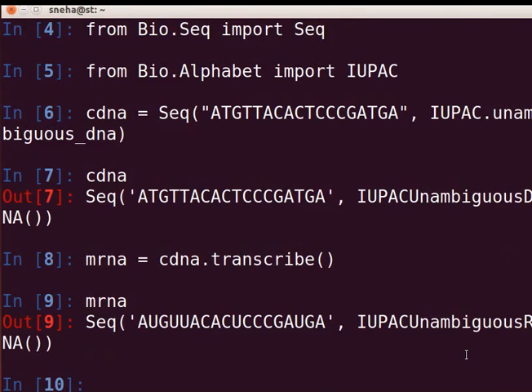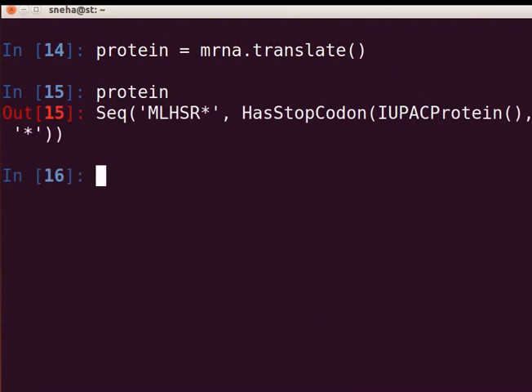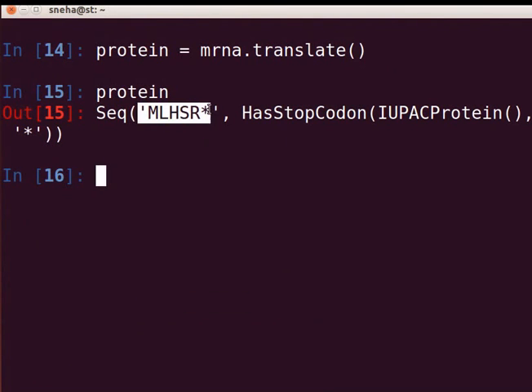Next, to translate this mRNA to the corresponding protein sequence, use the translate method. Type 'protein = mRNA.translate()' and press Enter. The translate method translates the RNA or DNA sequence using the standard genetic code if unspecified. The output shows an amino acid sequence and information regarding stop codons. Observe the asterisk at the end of the protein sequence — it indicates the stop codon.